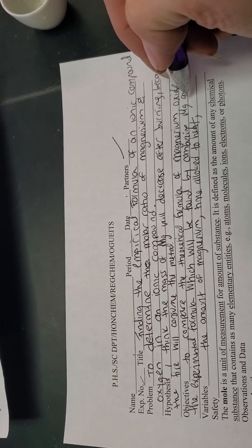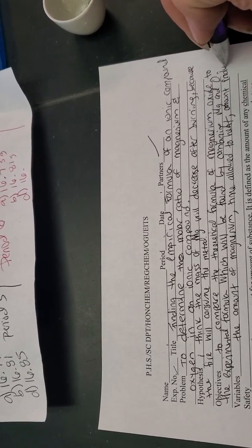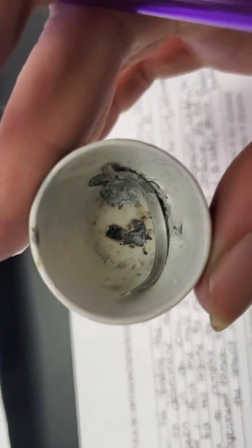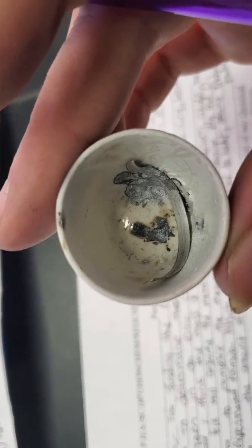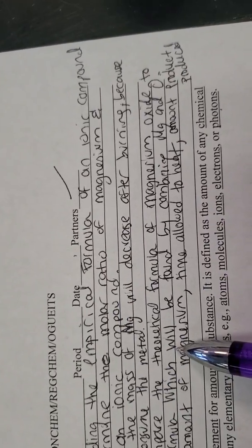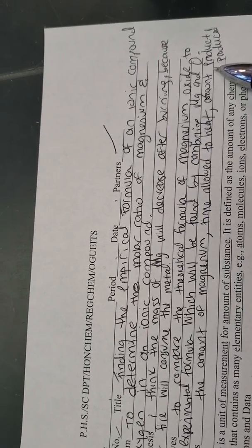And the last thing is the amount of product that I produce. So amount of product produced. Depending on how much magnesium and depending on how much time I allow that magnesium to burn, I'm going to produce a specific amount of product. It's going to depend, again, on the amount I start off with and how much time I allow that to react. Hopefully, I give it enough time to completely react so I can produce the maximum amount of product. But if I didn't give it enough time, I'm going to have less product than I actually could. If I gave more magnesium, I'm going to form more product. If I had less magnesium, I'm going to have less product. So these are the 3 variables.